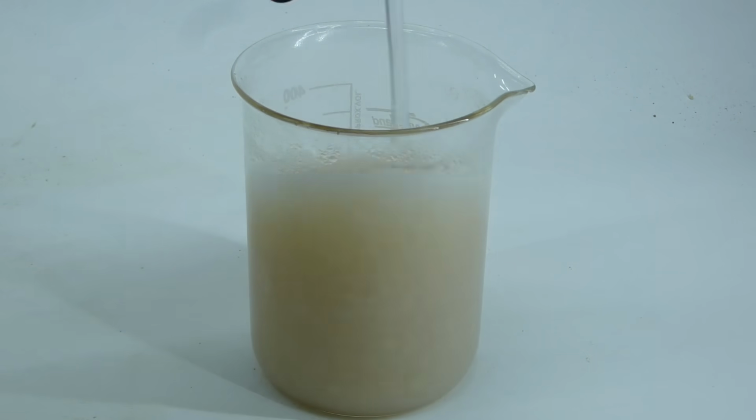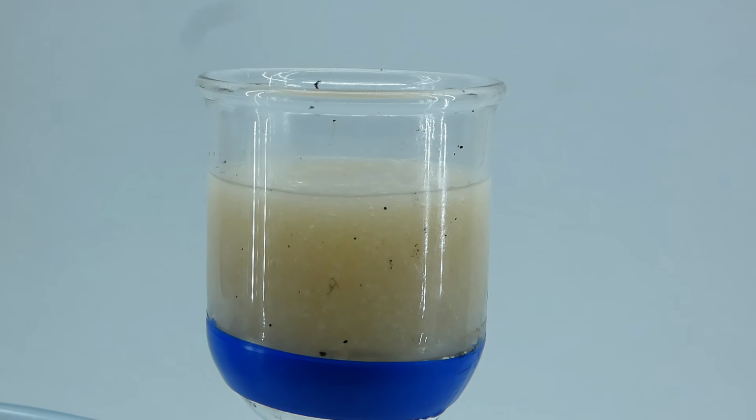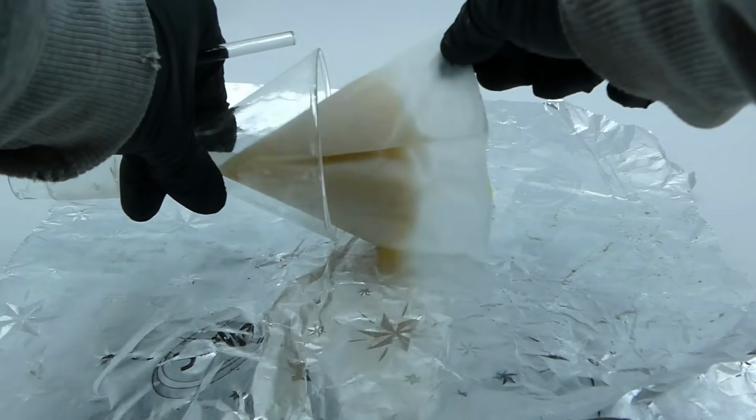After adding all of the acid, the mixture looks like the one from the chemical garden video, and now I have to filter it. I tried to use a vacuum filter, but it didn't work, so I proceeded to use a coffee filter, and after a night of filtering, I was left with a reasonably dry silicon dioxide jelly.